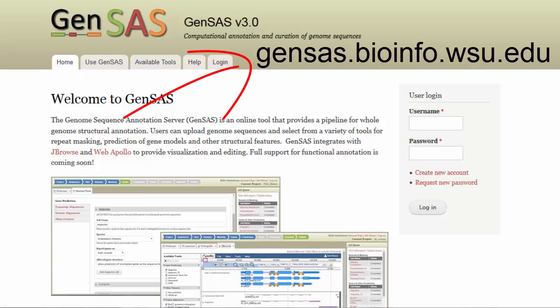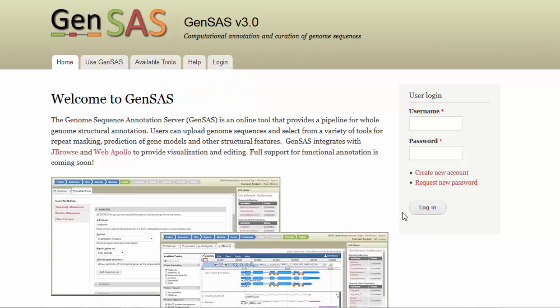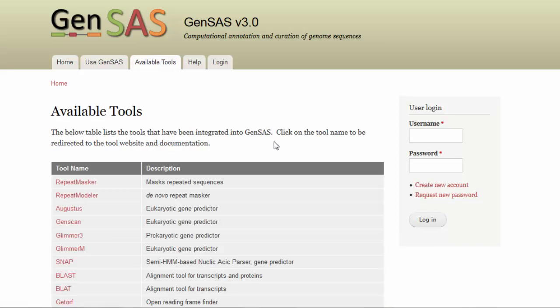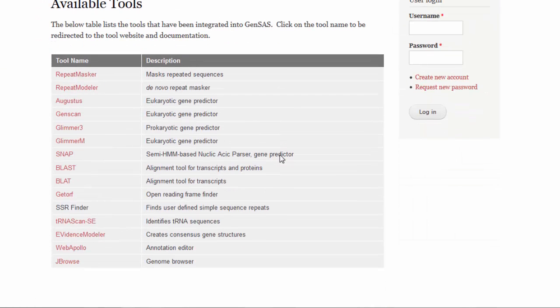The first step is to go to GenSaaS, which can be found at gensas.bioinfo.wsu.edu. On the homepage for GenSaaS, there are a few different tabs of interest. Under the Available Tools tab, there is a table of all the tools that have been integrated into GenSaaS with links to the documentation for each tool.